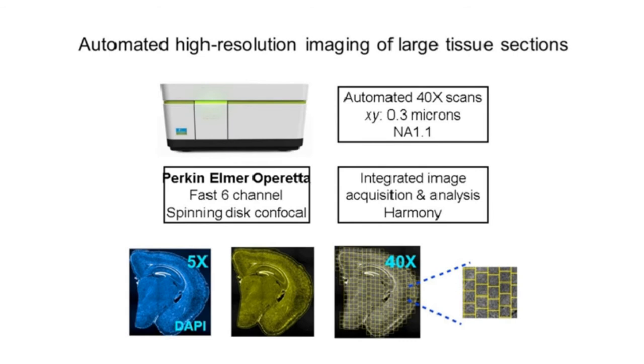After the imaging, we go about identifying and segmenting single cells across entire tissue sections and quantifying the number of RNA puncta. Importantly, the software that runs the imaging and the acquisition, Harmony, is present on the microscope. So our large image data, which grows into terabytes across days of image acquisition, does not have to leave the original system that we're using to take the images.